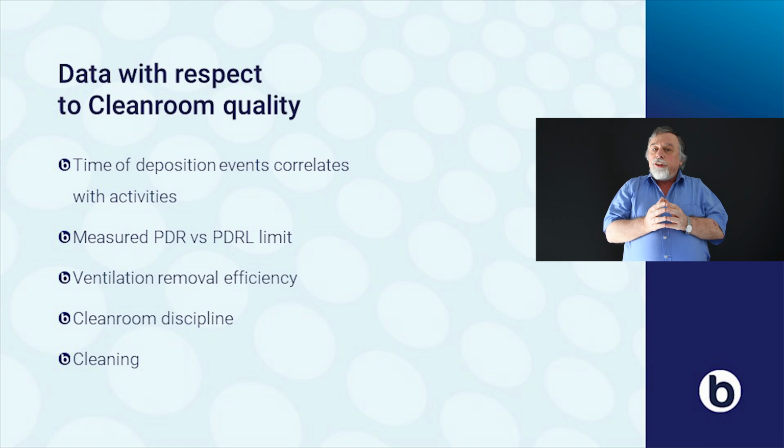The time of deposition correlates with the activities. So if you do real-time particle deposition monitoring, you can see when you have a high number of particles depositing on the surface and when it's low. Typically, when there are no activities, the particle deposition rate is low. When there's a lot of activity, you see it will be high. You can also look at what the real particle deposition rate is compared to the limit you've set from your risk assessment of your product.